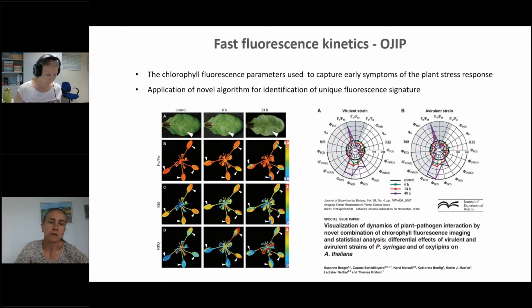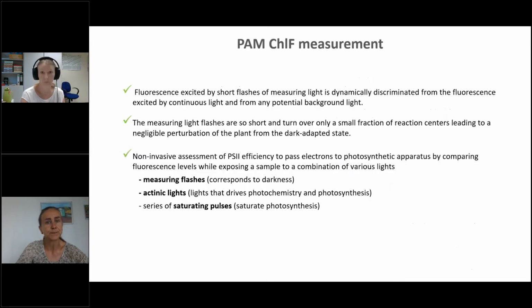So this would be a brief introduction mentioning the fast fluorescence kinetics type of measurement and the applications. And I would step now more into the pulse amplitude modulated chlorophyll fluorescence measurement that you heard about quite a bit in Tracy's talk. She introduced it pretty well.